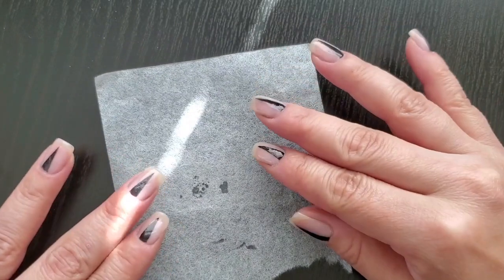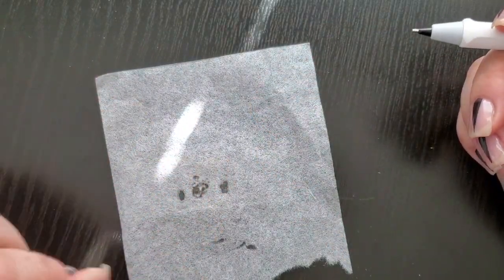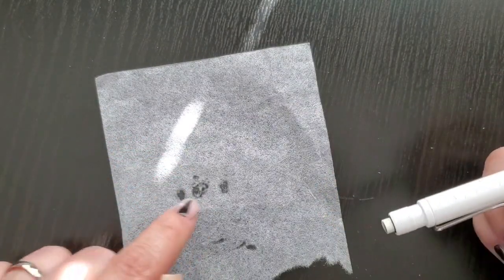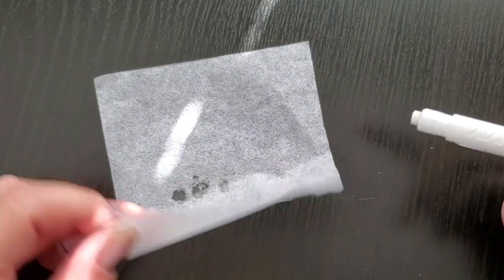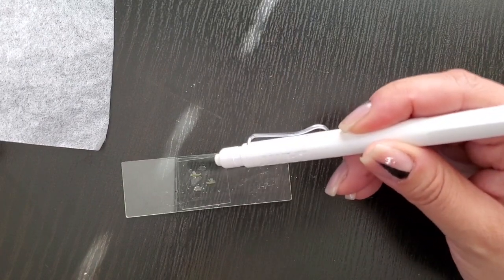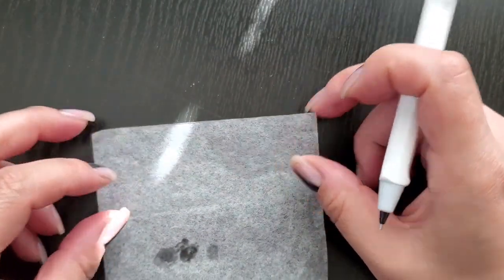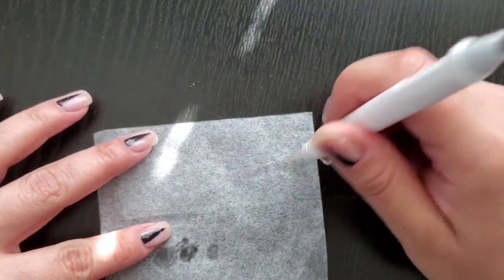And then what I'll actually do is just place this on top. Now this will help absorb the water that's going to be released when I start the pressure. But you want to remember where you had your sections. So they're kind of in this area, so there's no need to be applying any pressure to the corners. And it doesn't matter if it gets oil all over the top because we're still going to be using oil immersion.